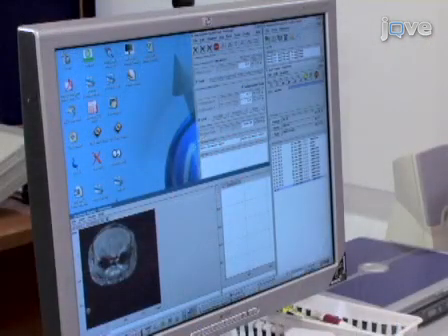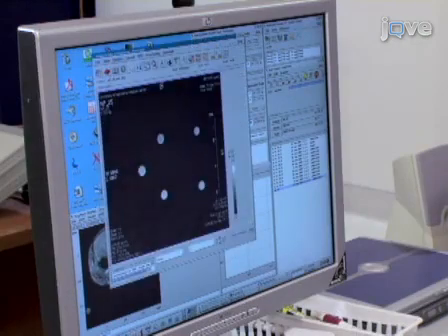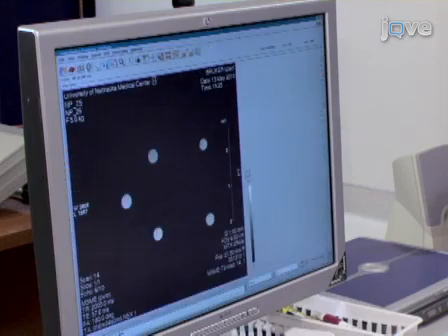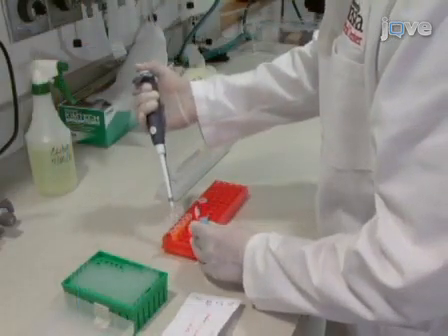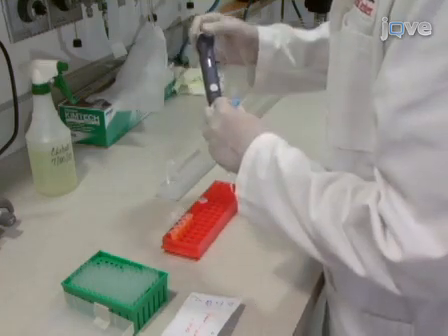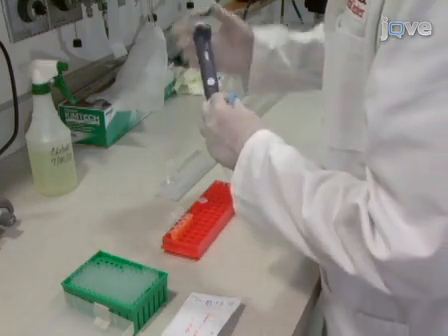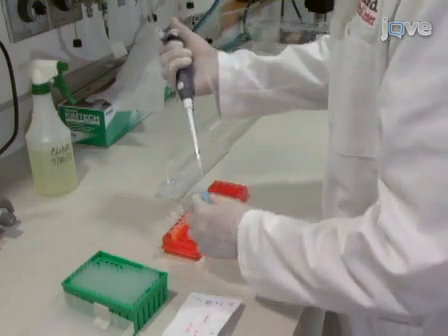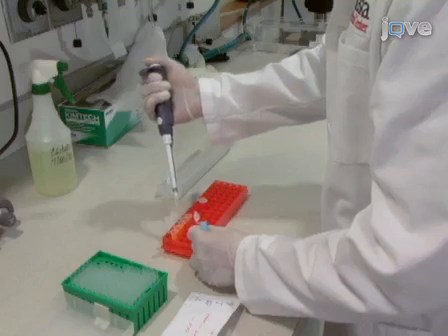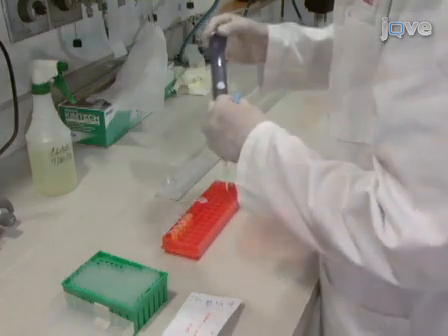Then, measure size, charge, shape, and cytotoxicity to determine whether the SPIO model system has the same properties as the candidate nanoformulated drug. Finally, perform cell loading assays by incubation with the candidate SPIO model nanoformulation to determine the relaxivity within the cells using phantoms composed of labeled cells suspended in agar gel.